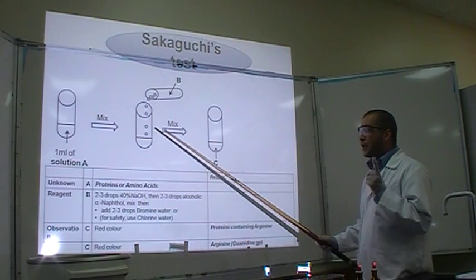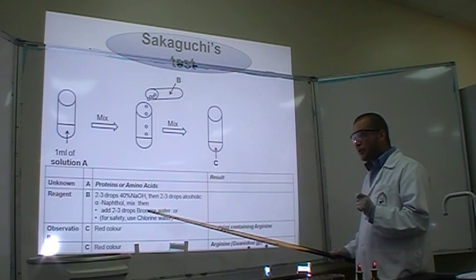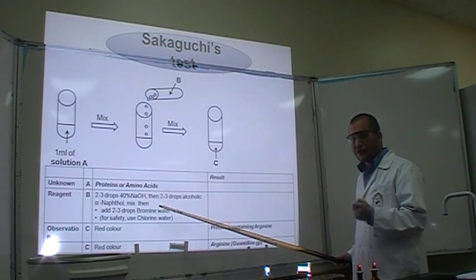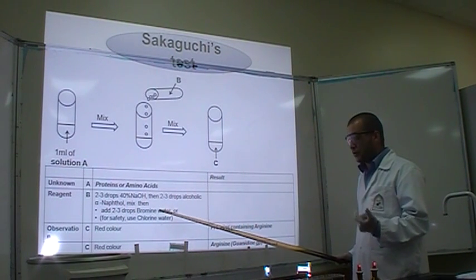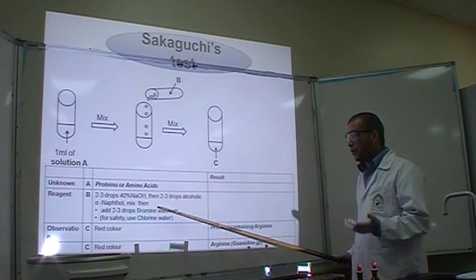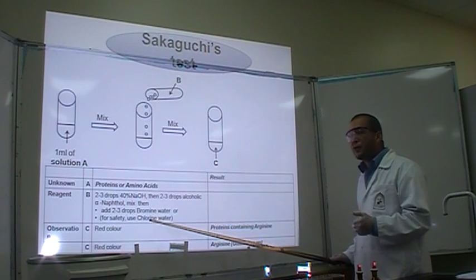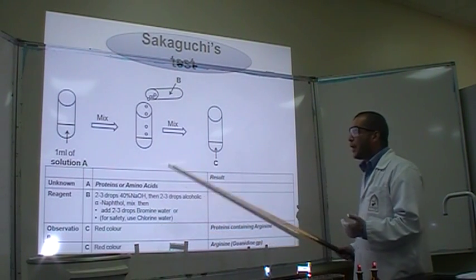And then, add 2-3 drops of bromine water. But, you know, bromine water is not good for your health. It can have adverse effects. So, you can replace it with chlorine water. And then, mix.